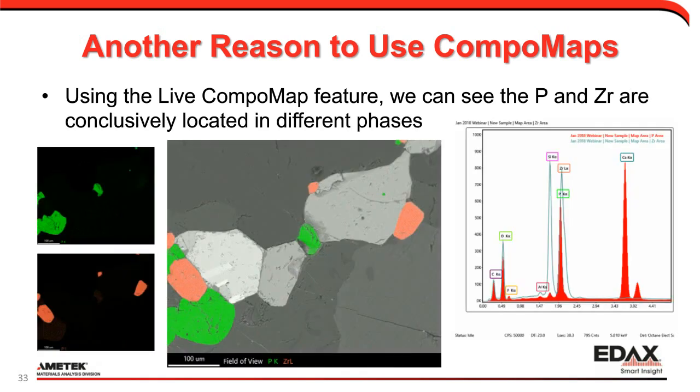And now when we look at it all combined together, we see that the two element maps on the left-hand side are in separate areas. We overlay them, and we could even overlay them on top of the image. That gives us a better visual about where the grain level and the correlations are all together, and also some nice topographical information. There are a few divots in the sample, and we could see that with our CPS map, not shown, but a good feature to use to describe the topography of a sample.